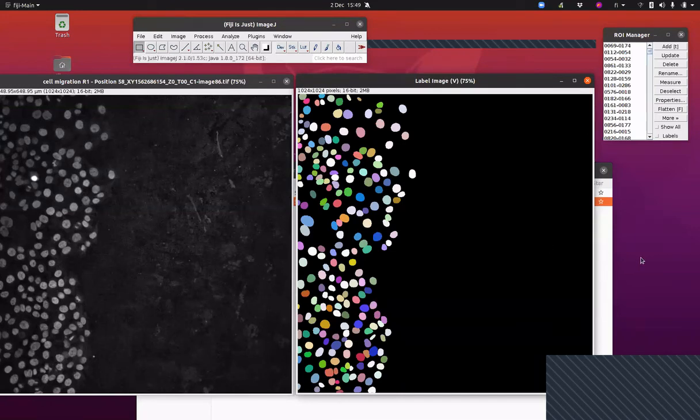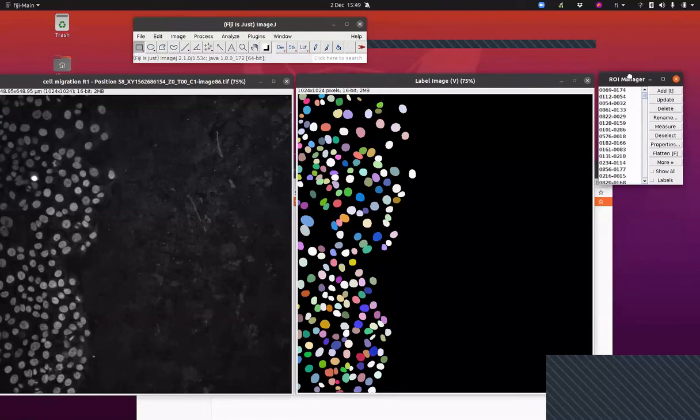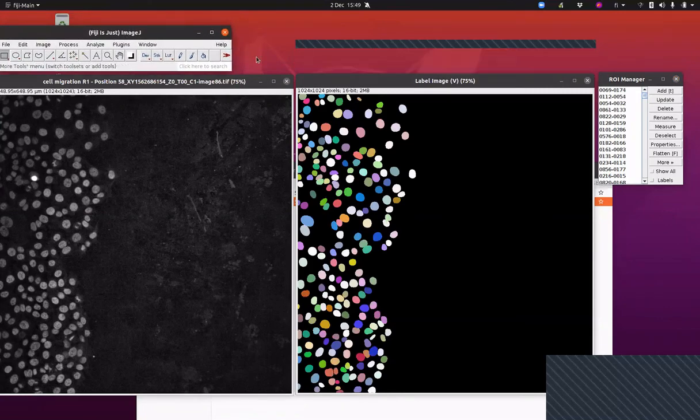Is anyone else stuck here? Yeah, as well? Use the pre-trained model to be versatile. And you've ticked that box, right? Yeah. It says the learning rate cannot be identified. So, and then create the model. So yeah, I did the 10 epochs. Then I have the.